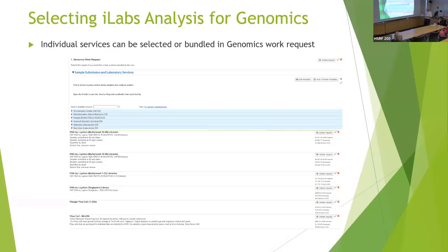However, one of the things that we do have is consults, and that's been gone over a few times, and we do want consults for large projects. The same way you go into proteomics or microscopy imaging, we have the same tabs that they have, so you can actually schedule a consult. We usually pull together a Zoom meeting so we can all get together and talk about it, because a lot of these projects get pretty expensive. Not unlike proteomics, our single cell projects can get up to $20,000 or more. So we want to have these consults with you.